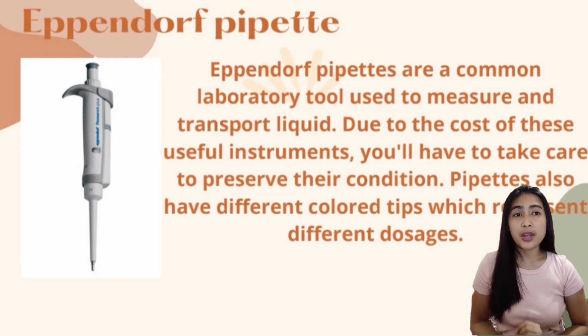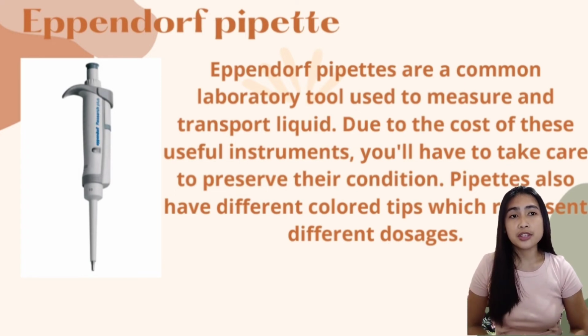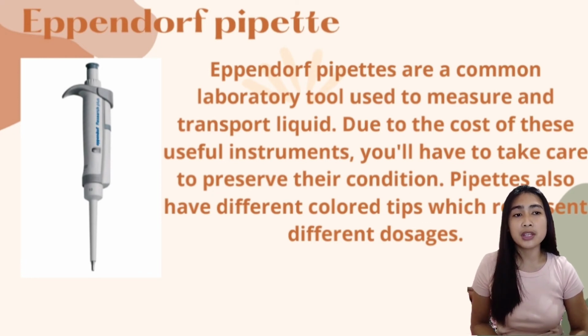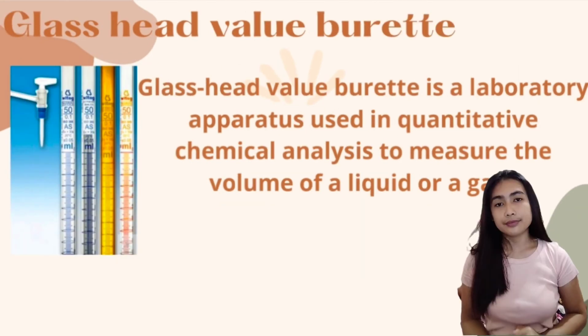Next is the Eppendorf pipettes. Eppendorf pipettes are a common laboratory tool used to measure and transport liquid. Due to the cost of these useful instruments, you'll have to take care to preserve their condition. Pipettes also have different colored tips which represent different dosages.